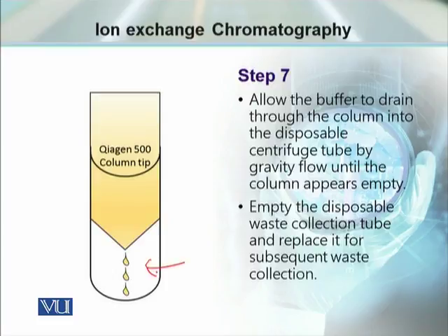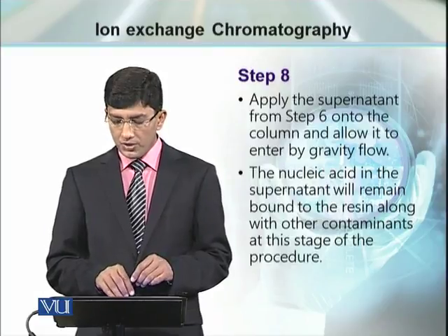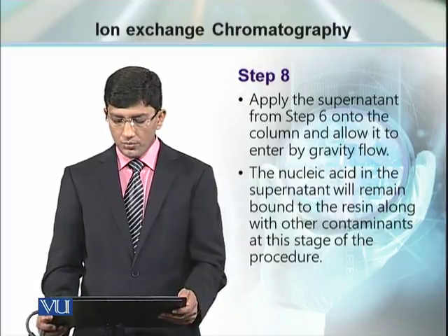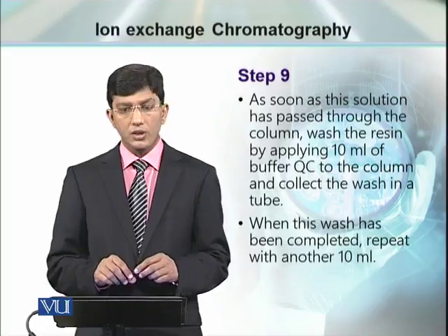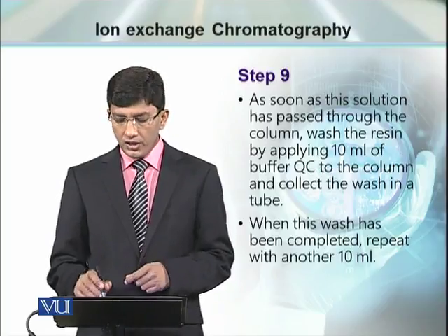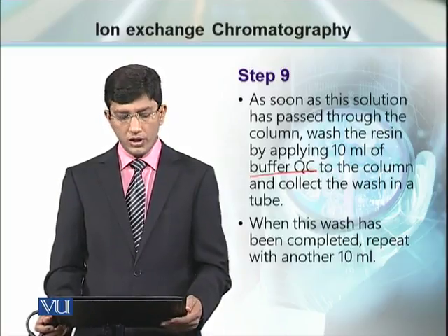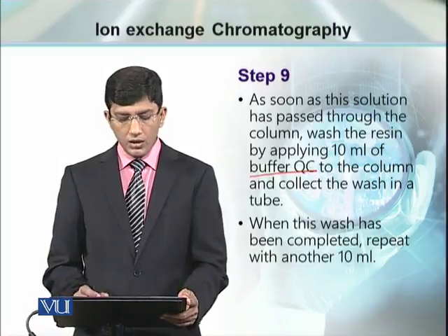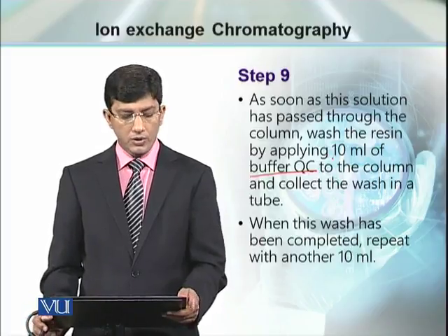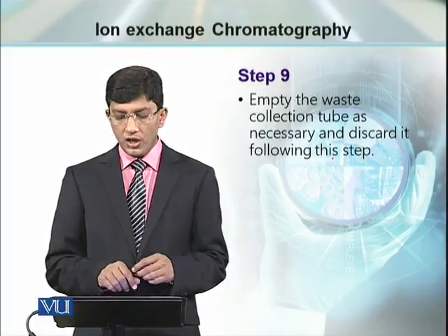The next step is to apply the supernatant on this column, which was made available from step number 6. This is a mixture of nucleic acid, and once we apply it on this column, the DNA is going to be bound with the resin. After applying the supernatant, 10 milliliter of QC buffer is added so as to wash out any unwanted molecules, and washing is done using this 10 ml QC buffer 2 times to ensure good quality elution. At the same time, keep in mind to empty the waste collection tube.